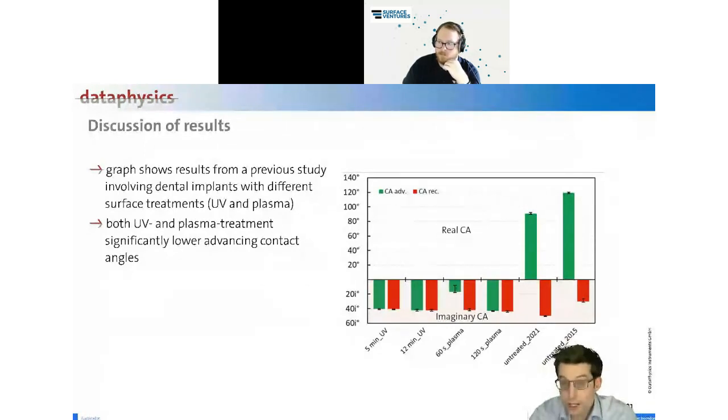some UV light-based devices. Inside these devices, you put the little implant, switch it on, and then by UV light, the surface of the implant is activated. I assume you know UV light, this is very high energy light, and I guess it's partially also leading to oxidation of the surface and making it more rough through this.